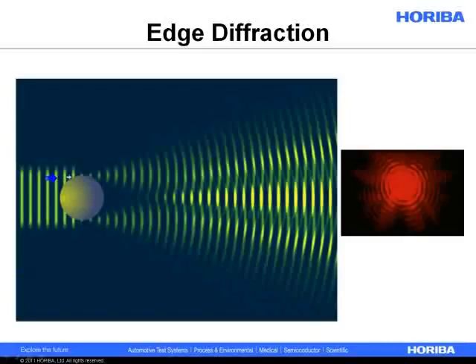So again, here's our basic mental model. We have a point scatter in space. We have some well-behaved column of light hitting it. Typically, in modern laser diffraction analyzers, this is laser light. It hits the edge of the particle, and it begins creating interference patterns. Basically, it creates waves off of the two-point surfaces here, and the waves begin to overlap. It's hard to do, but if you could reach into the screen, take this image and rotate it so that you were looking at it head-on, this is what we would see. The center here is our point scatter, and we see radiating lines of minima and maxima.